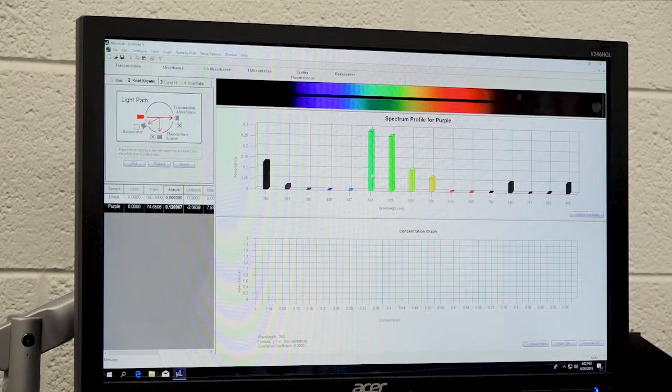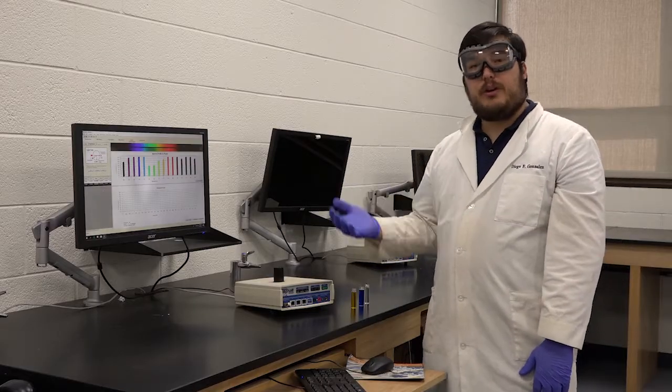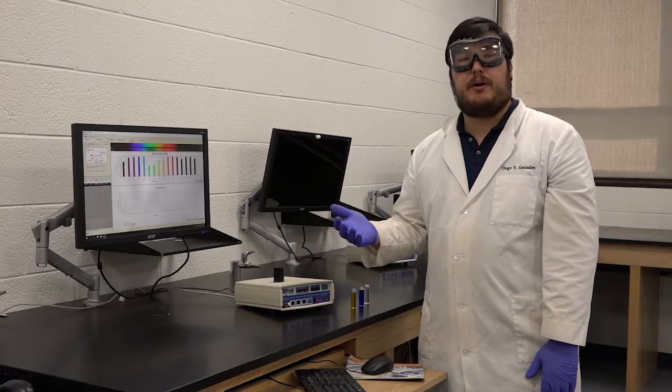Potassium permanganate reflects purple, and that's why we see purple, and it absorbs green, which is why on the absorption spectra, we see the 502 wavelength of green at high absorbance. While on the transmission spectrum, we see that the other colors are being reflected, and we see that the 395 and the 430 are the largest transmitting wavelengths shown on the screen. From there, we can restart the program to begin the mixing part of step 1.